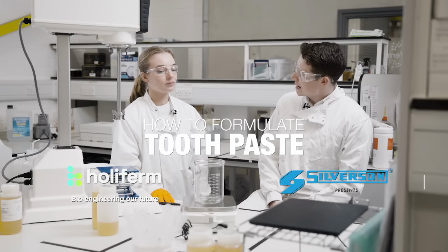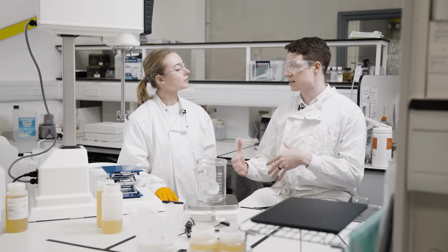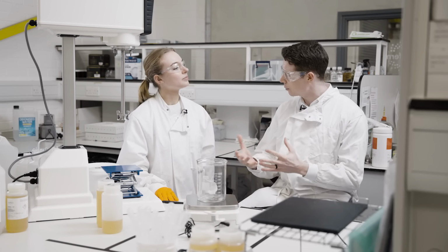So we're here today at Holiferm R&D Laboratory in Manchester. Thank you so much for having me, Clarissa. You're welcome. And you're an application scientist for Holiferm, but today we're talking specifically about how sophorolipids assist in the formulation of toothpaste. Can you tell me a bit about that?